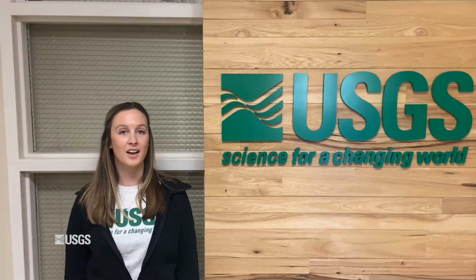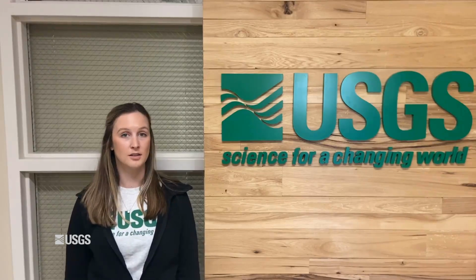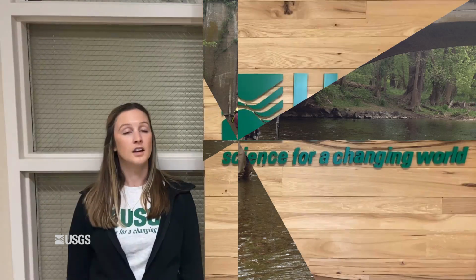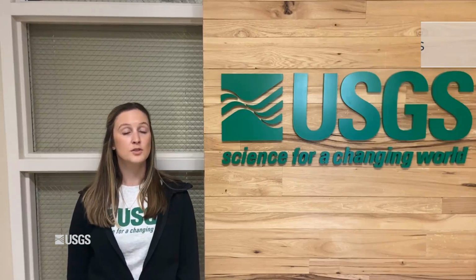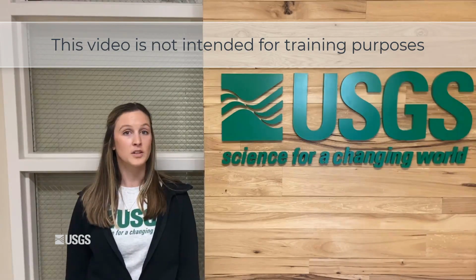Hi, I'm Molly Schreiner. I am a hydrologic technician with the USGS at the New Jersey Water Science Center. I started here in 2012 as a student intern. Today, I focus on water quality sampling and analysis. Hydrologic technicians for the USGS usually specialize in one of three major disciplines: surface water, groundwater, and water quality sampling. This video shows me and a few of my colleagues in Nevada and New Jersey performing some water quality sampling.